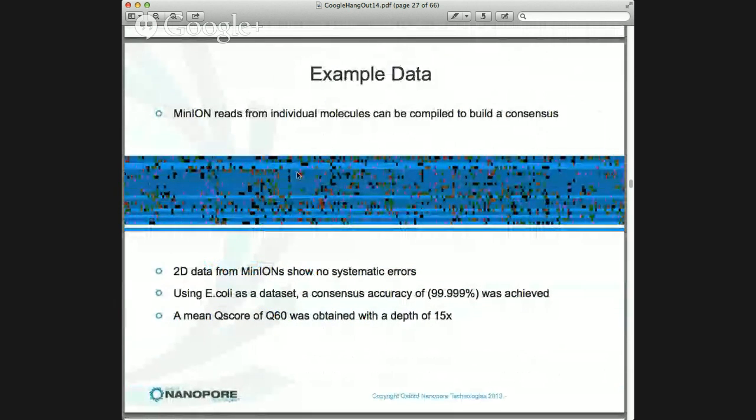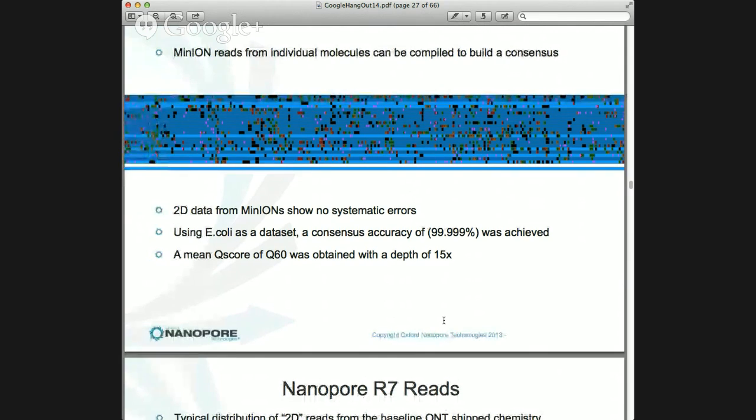Now, I think this is our data. I get confused. It might be mapper data that we've got, but I think mappers have tweeted similar things. When you align these data correctly, errors average out in consensus, and I think most people have got high consensus accuracy at relatively modest levels of coverage. That's not to say there aren't some biases in the errors. I mean, most early platforms have some error bias, but it doesn't dominate the consensus, even at relatively modest coverage. And I'm pretty confident that that's going to be removed with future tweaks anyway. Hopefully people are writing those things up.